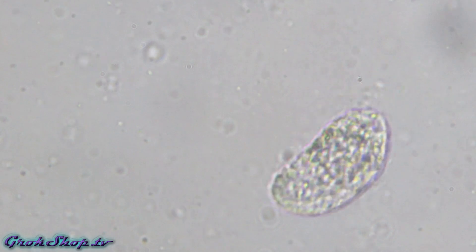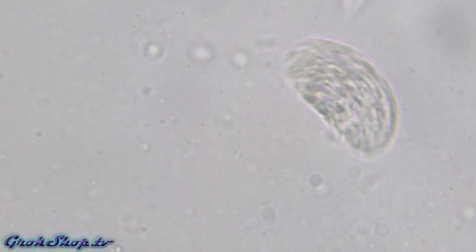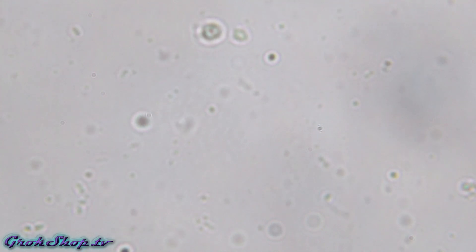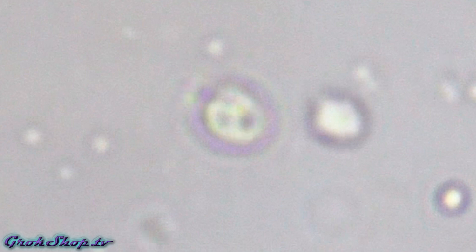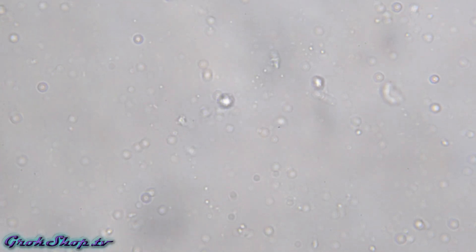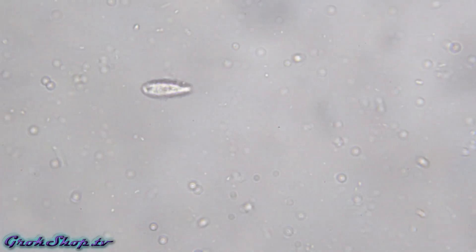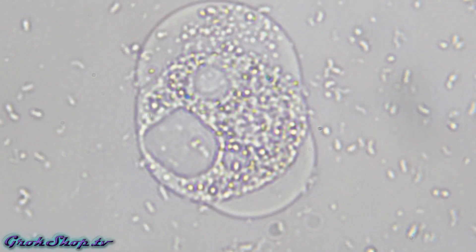Nice flagellated protozoa here. Fast moving critter here is a ciliate, possibly a paramecium. These things can get up to about 300 micrometers or so — almost a third of a millimeter. You can almost see the big ones with your naked eye.